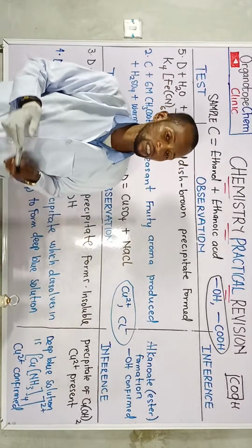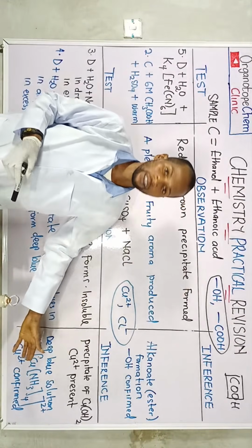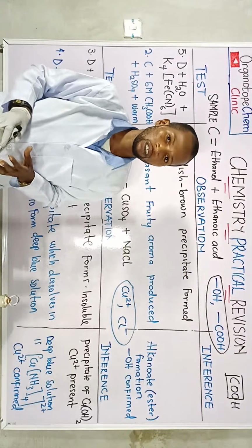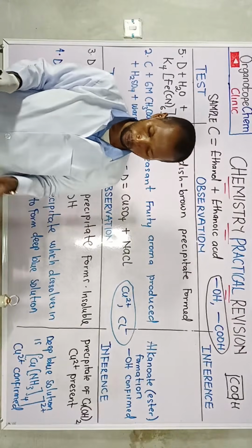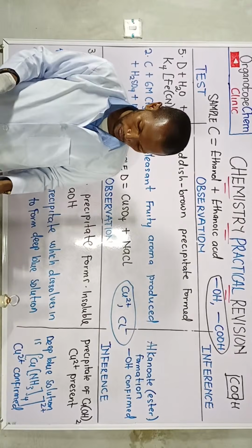Now, this particular test is also confirming the copper. But before you write the confirmation, what is the formula for the precipitate formed?